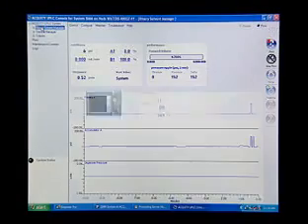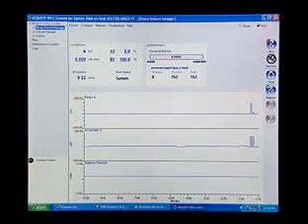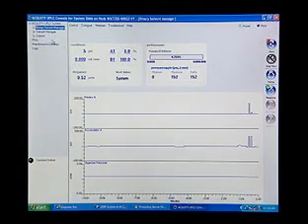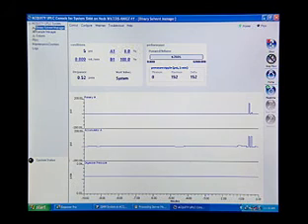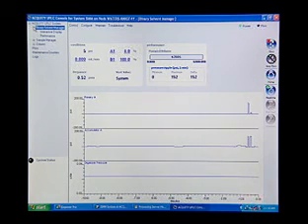In the console, select Binary Solvent Manager from the system tree. Expand the tree and then click Interactive Display.